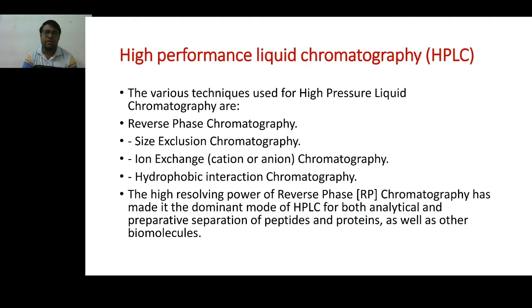In high performance liquid chromatography, various modes are used: reverse phase chromatography, normal phase chromatography, size exclusion chromatography, ion exchange chromatography, and hydrophobic interaction chromatography.